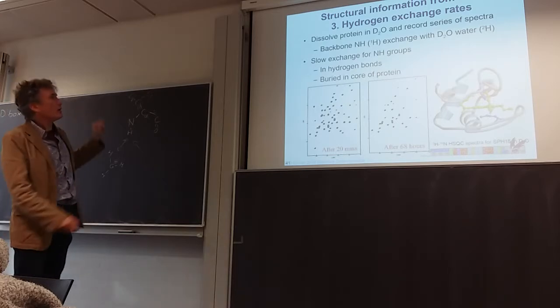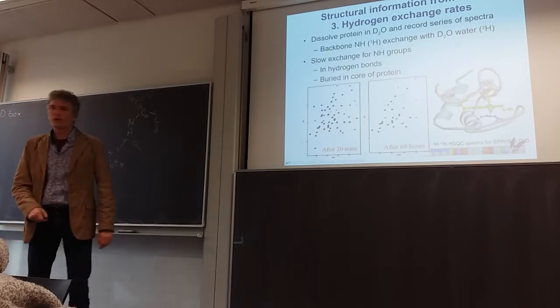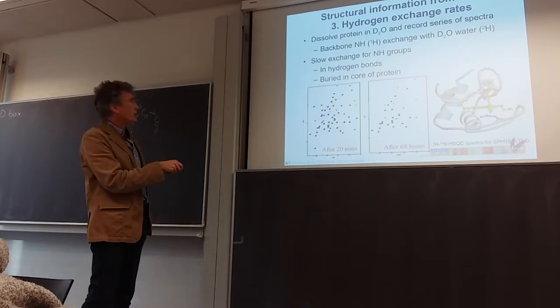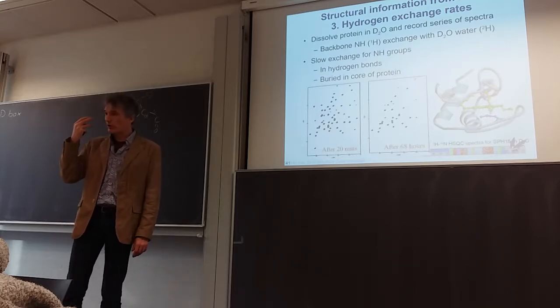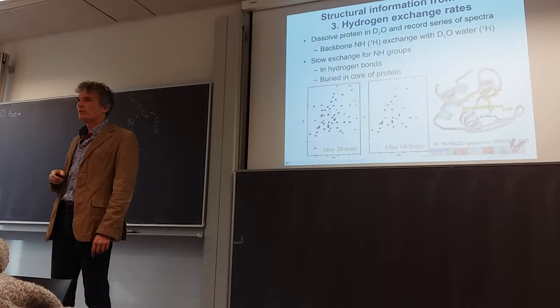So if you take, which protein is this? SPH15. I haven't looked up recently what that is. You put this protein in D2O, you take the spectrum after 20 minutes. You already don't see peaks for most of the hydrogens. So which ones would you have lost already after 20 minutes? Why would you not lose all of them?